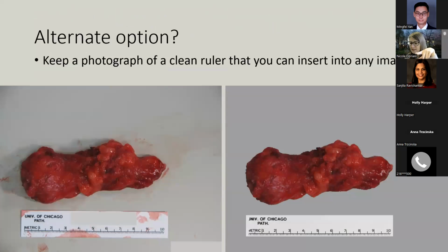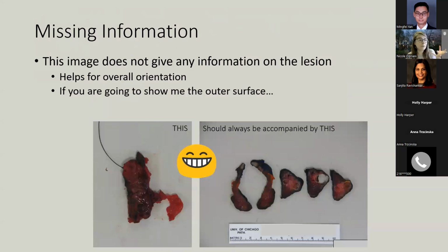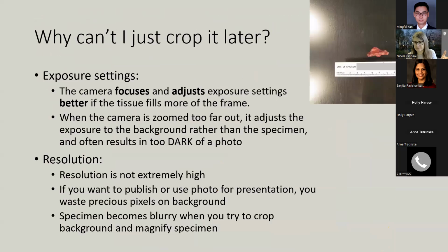Where is it? The example, like, yeah, this one, right? This one, I just wiped everything. I wiped the shadow, I wiped the blood, I wiped everything. So it's kind of floating in space without a shadow. Some people don't like this look because it makes a specimen look a little floaty, like it's not grounded. So some people like the shadow to show the grounding.